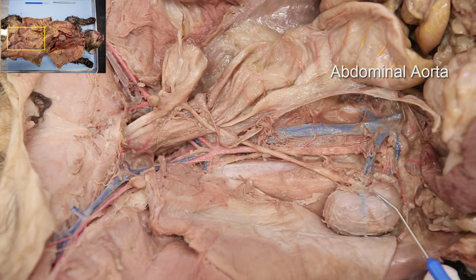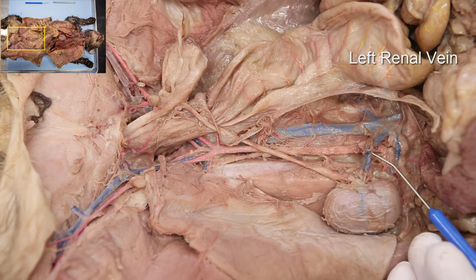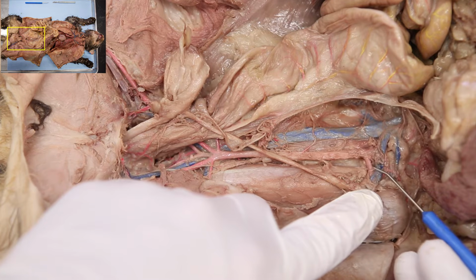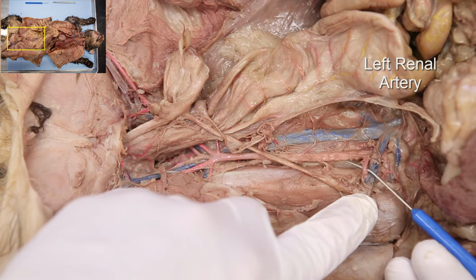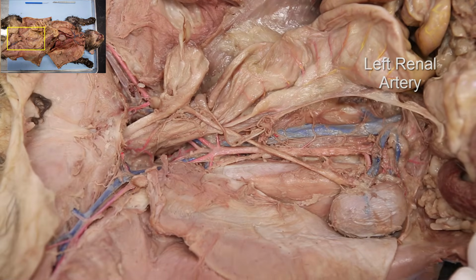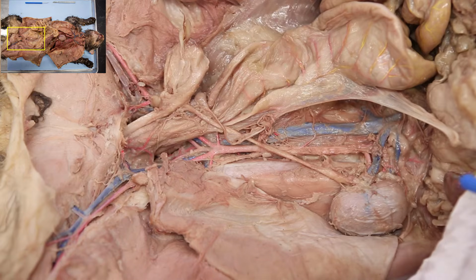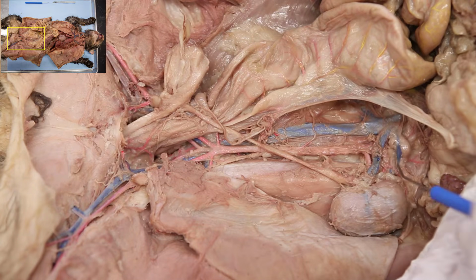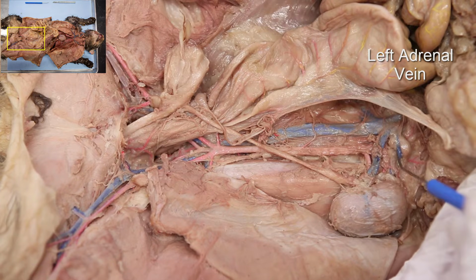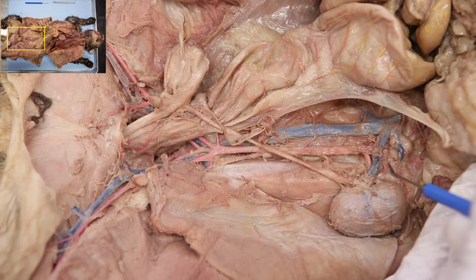You can see here to the kidney, this is the left renal vein. Just below it, there we go, this is the left renal artery. Looking just above it, we can see that right here, we're going to have the adrenal, so the left adrenal vein, and the artery is buried a little bit below right there, so the left adrenal artery.